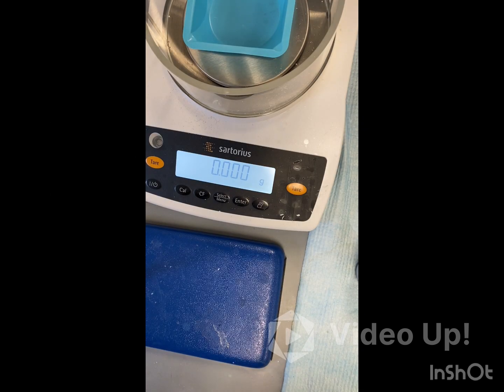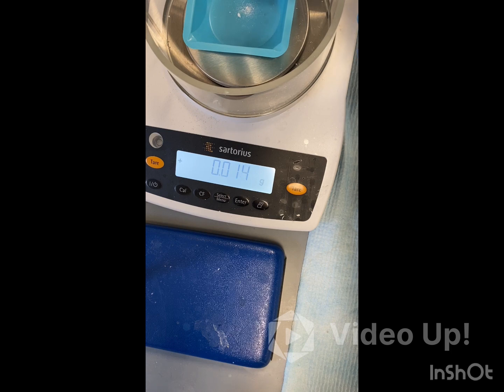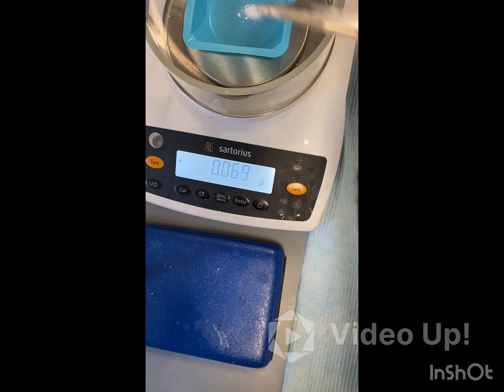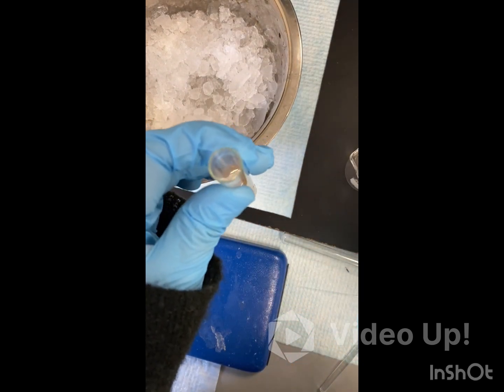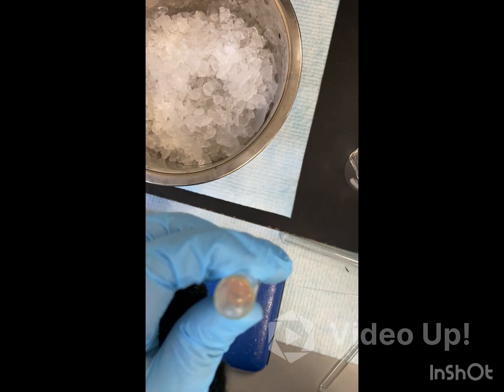Now that we've calculated how much sodium borohydride we need, we are going to weigh it out on our already tared weigh boat. That is our mass of sodium borohydride. We're going to add our sodium borohydride to our vanillin acetate mixture and we are going to periodically stir this for around 15 minutes — stir it about every three to five minutes.